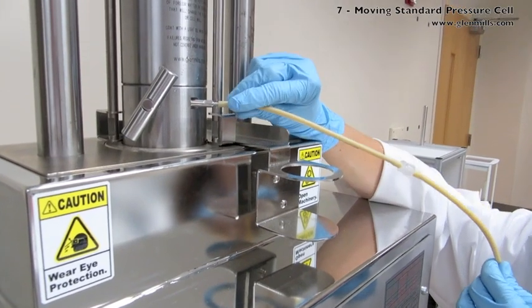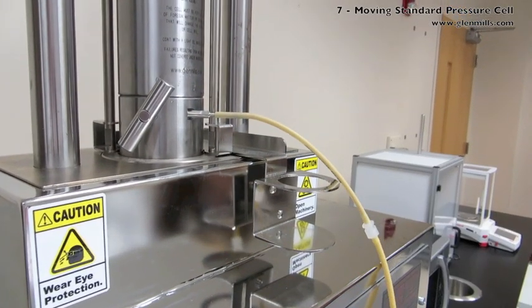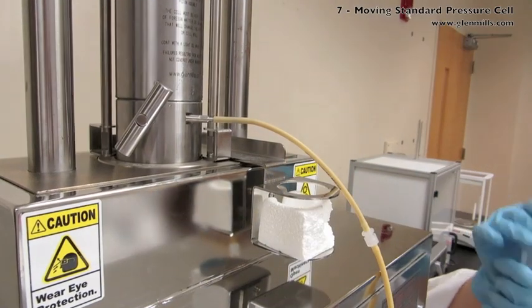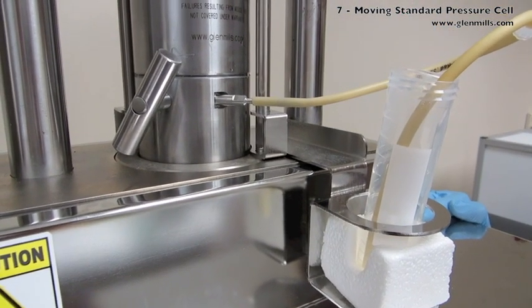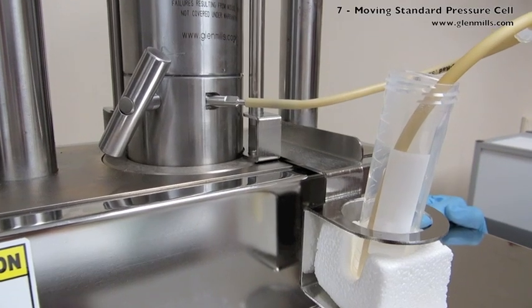Position the sample outlet tube and extension flexible tube to direct the output into the collection beaker that is sitting in the tray. As the lower platen moves, this tray will ride up to stay in position while collecting the sample.